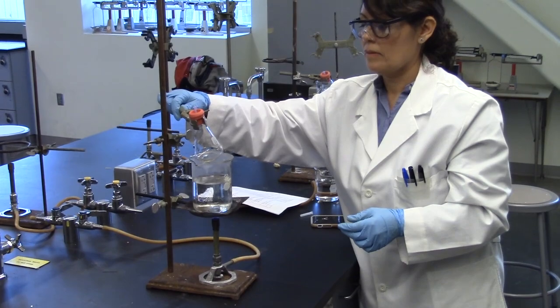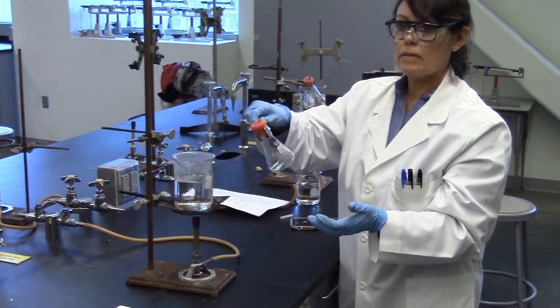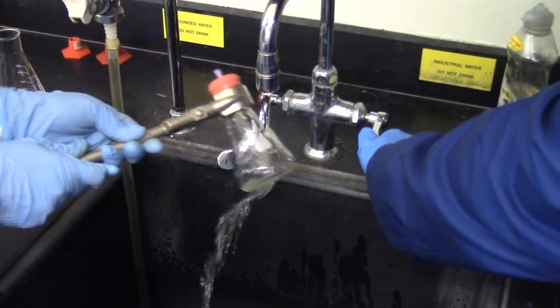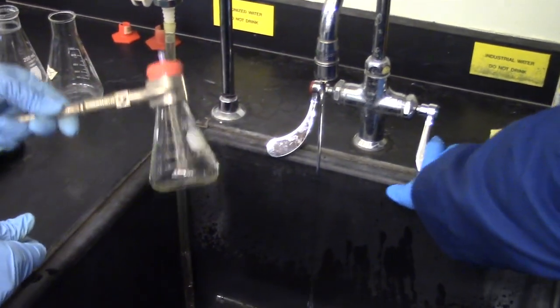Cool the flask under a stream of cool tap water to condense the vapor in the flask. The unknown will condense at a perceptible rate. Remove the capillary.